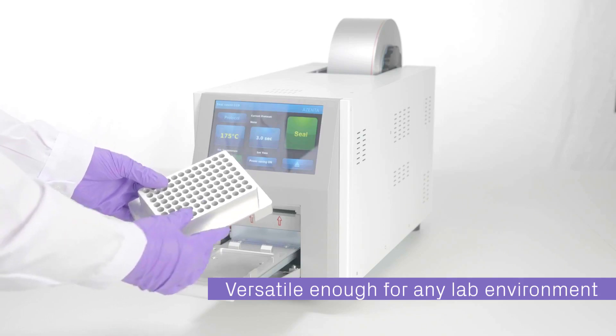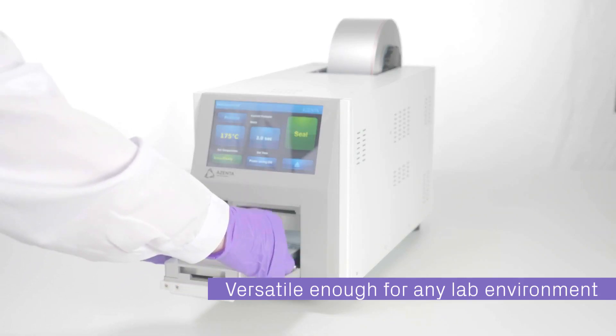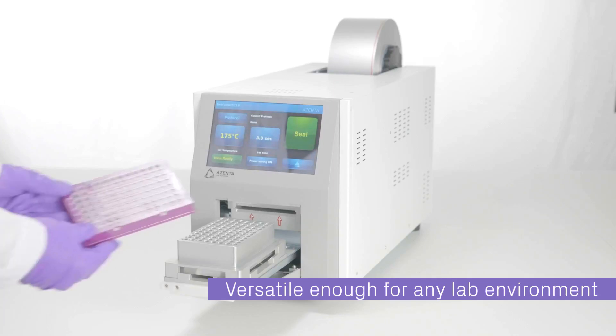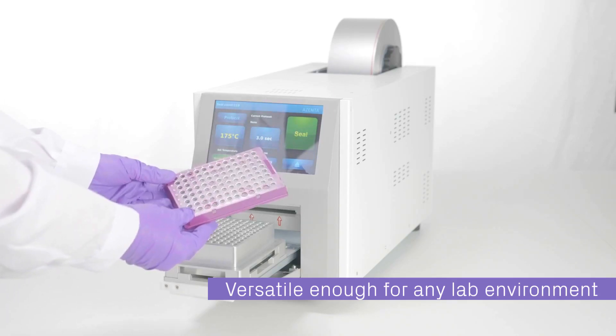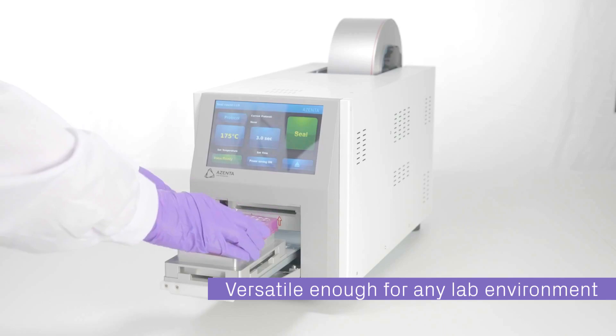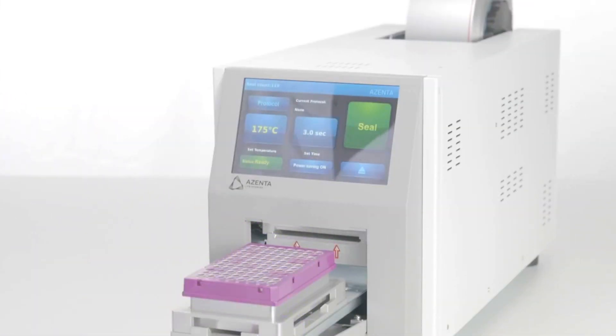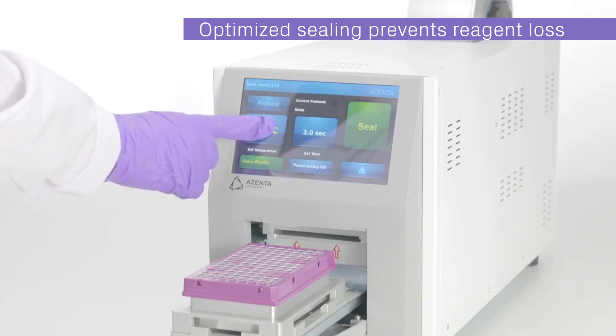From pharmaceuticals to biotech and research labs, the automated roll heat sealer is versatile enough to meet the demands of any laboratory environment. At Azenta Life Sciences, we know heat sealing is the optimal method across a wide range of applications. Are you doing QPCR? Optimized sealing performance prevents reagent volume loss.